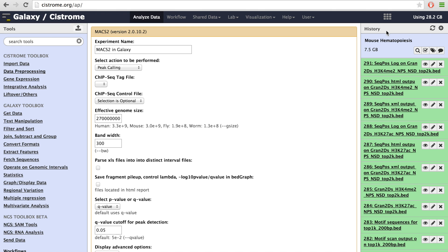The right panel shows the list of files stored in the user's working history, including all input and output data files and work logs.